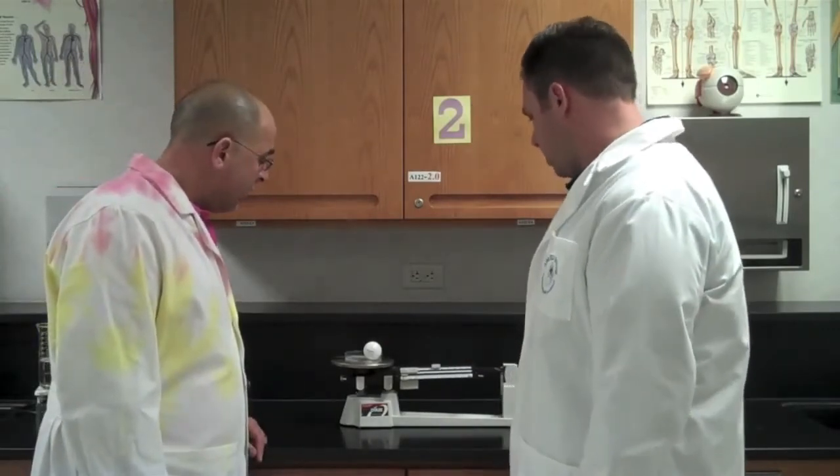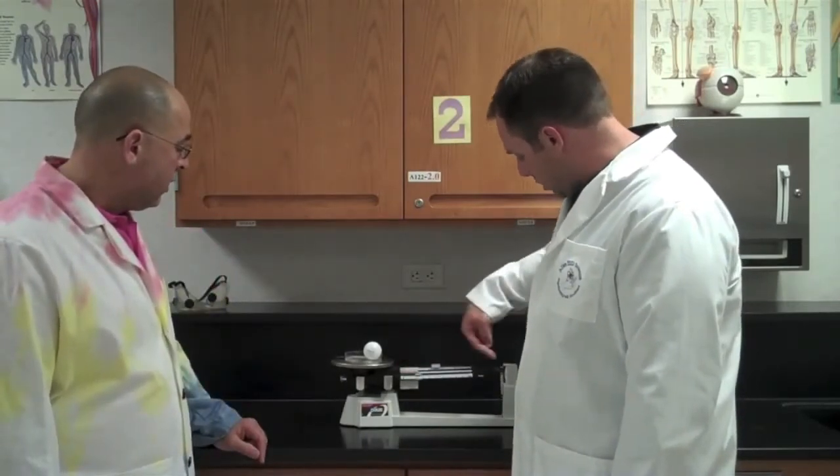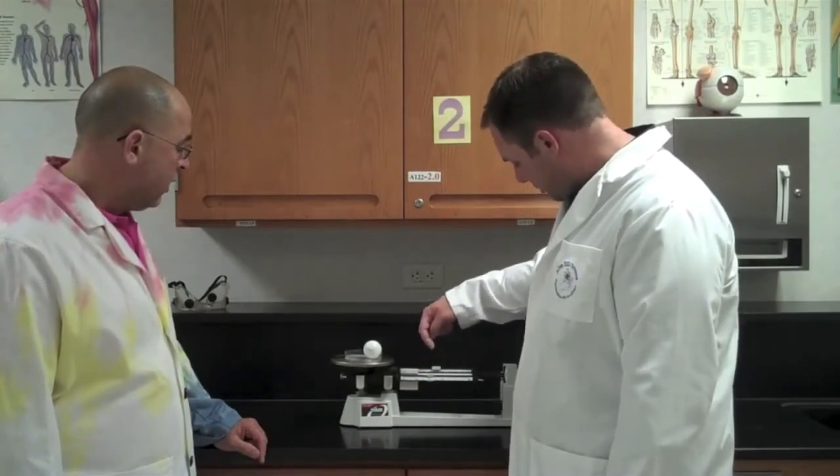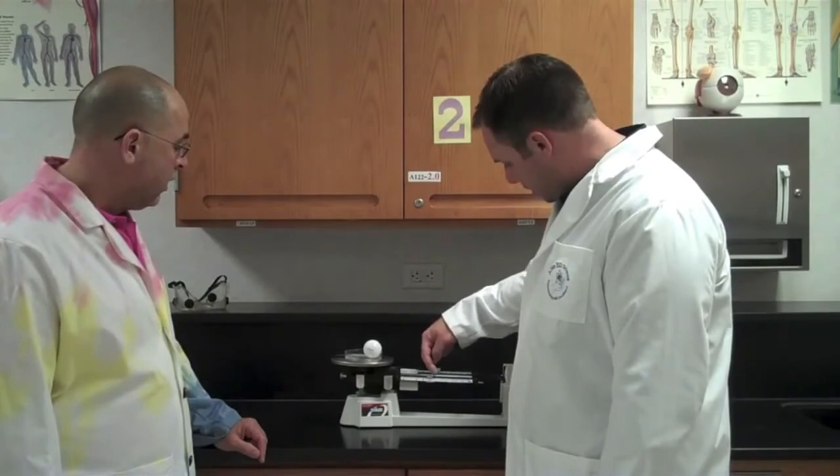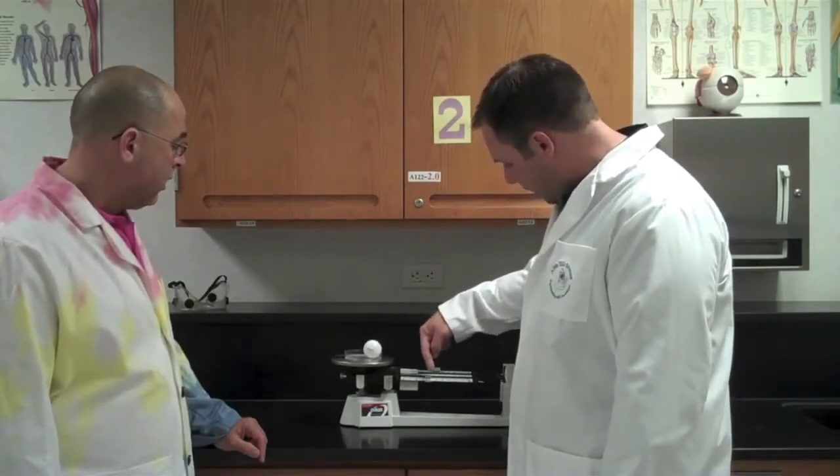So we're going to go back to 50, and then now what we're going to do is move the front rider until we get the pointer pointing directly at the zero point, which is pretty close. So we're going to say it's up here, it's 4. The back one is 50. If I simply take 50 and add it to 4, that is 54. 54, again, we measure mass in grams.